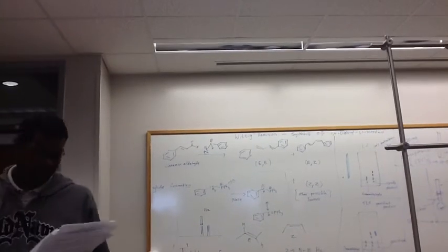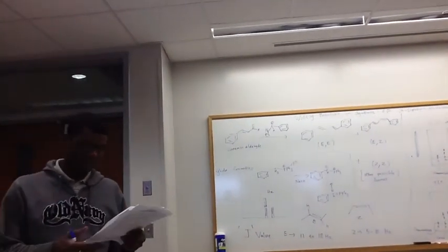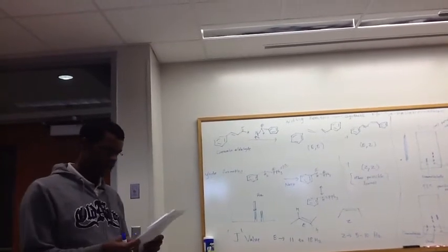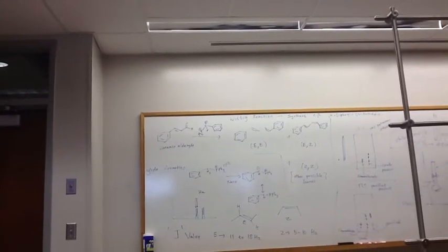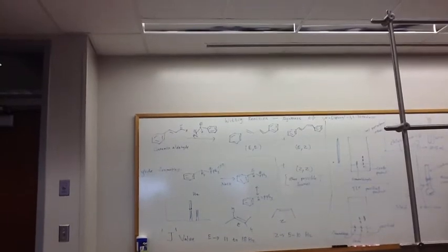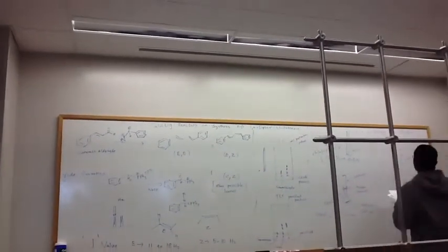Alright, so the procedure at the start says to take 1 millimole of the cinnamaldehyde. That comes to about 0.132 grams. Cinnamaldehyde is a liquid, right?